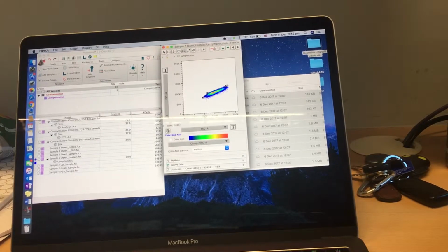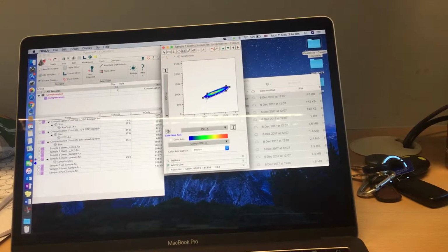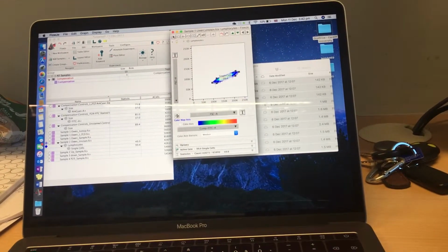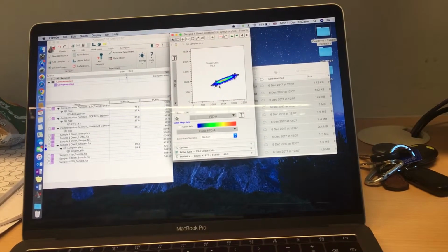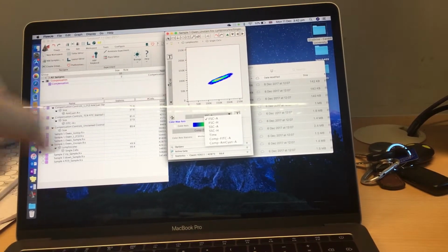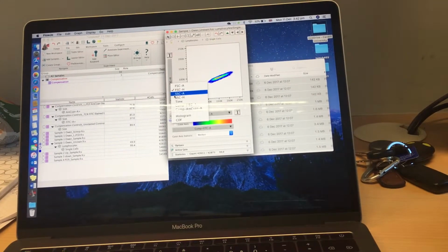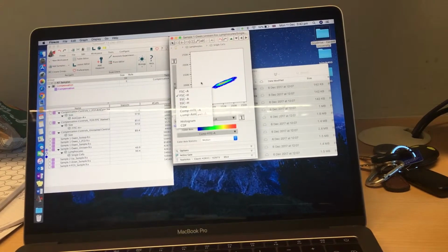Gate. Okay, again. And you want to do side scatter W on this side? Side scatter. No, it's not there. Okay, ignore it, don't worry about it.